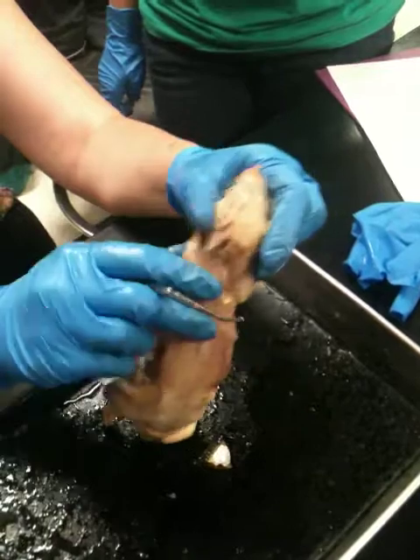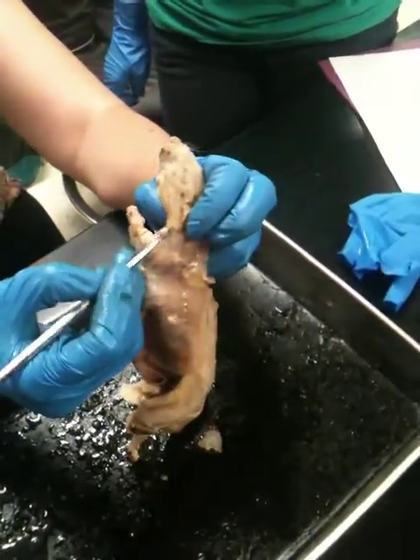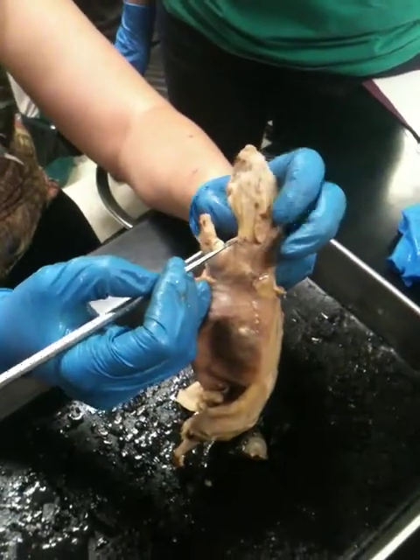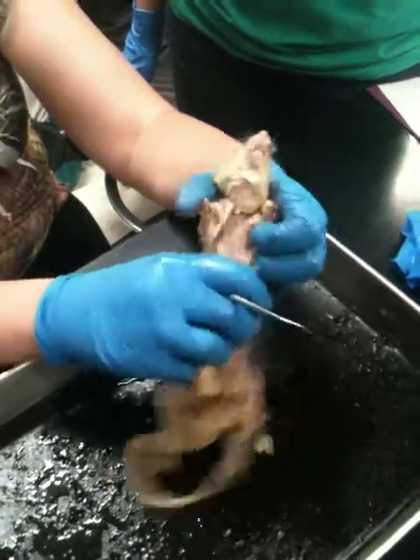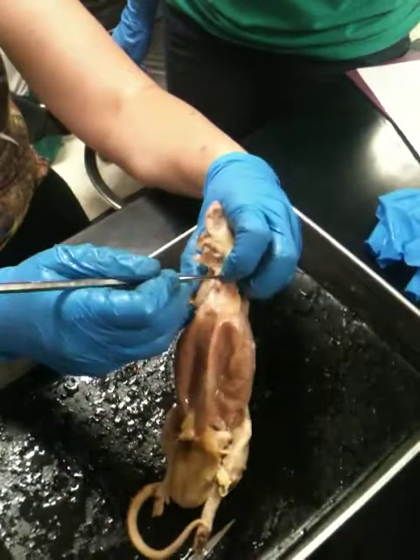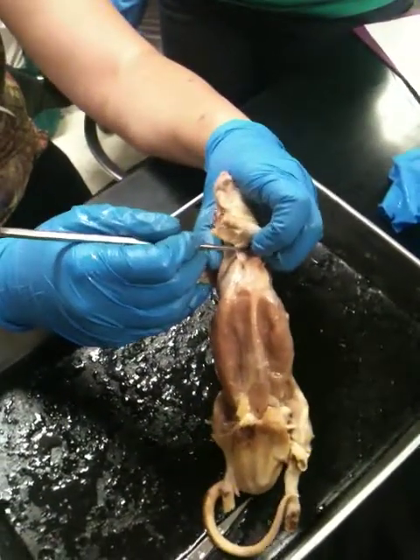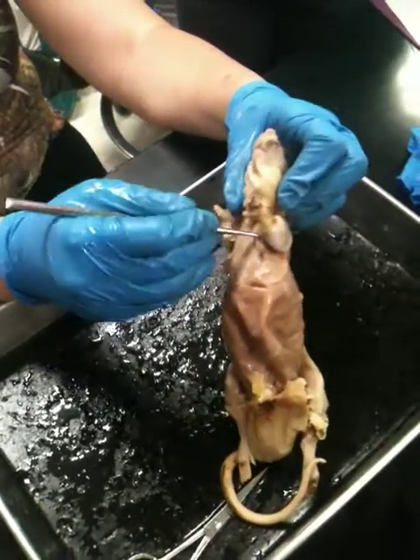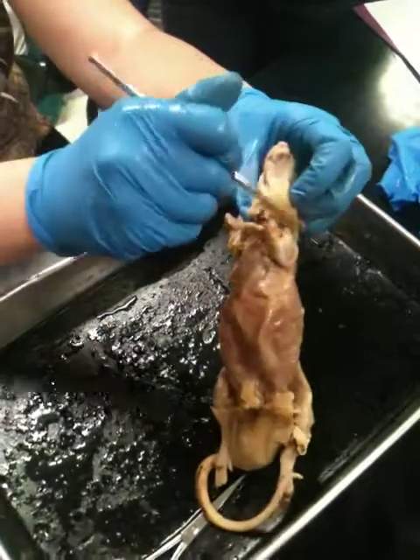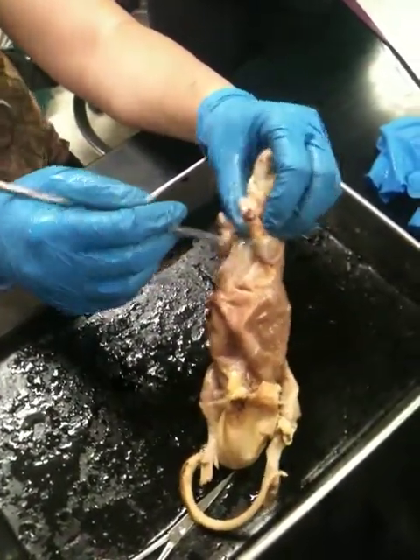Now, a rat is really muscular, so it's not always easy to see, but this little bump right here is equivalent to a shoulder. So this is acromial. And if we pull the rat back a little bit, this over here, the armpit, is going to be the axillary. So think about from top to bottom, we can alphabetize this. AC is on top, AX is on the opposite side, on the bottom.